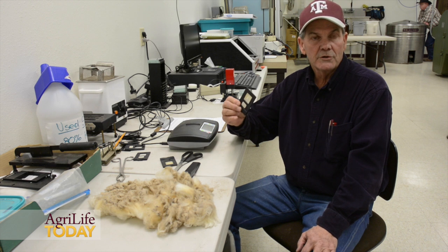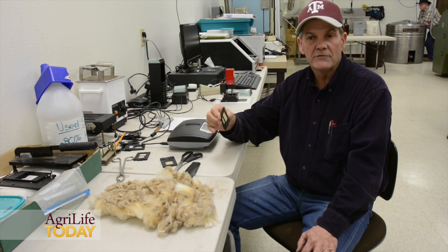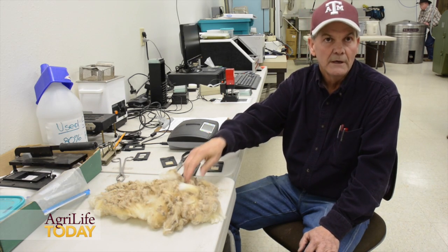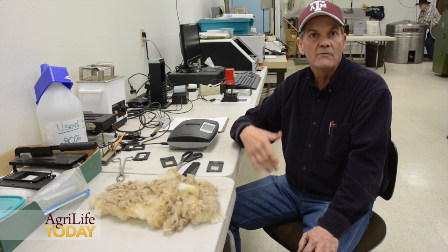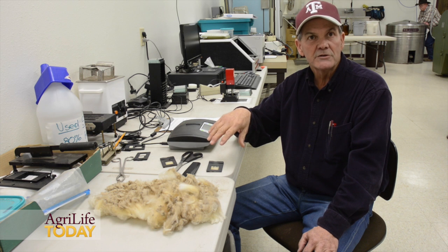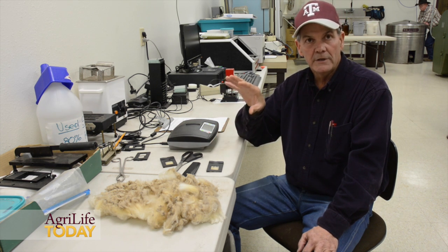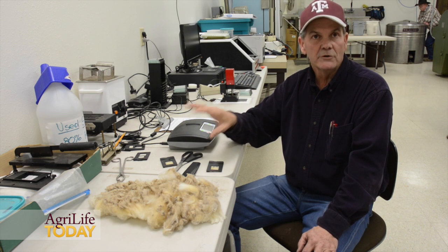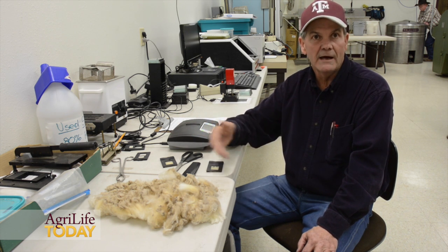We've never been able to accurately predict average fiber diameter from greasy wool — the raw wool had to be processed, washed and cleaned before we could determine fiber diameter. These two instruments allow us to get around that, where we can test greasy samples on an individual animal or on a fleece in real-time, to where decisions could be made on the fly, immediately.